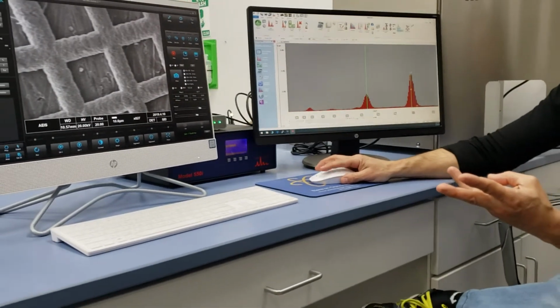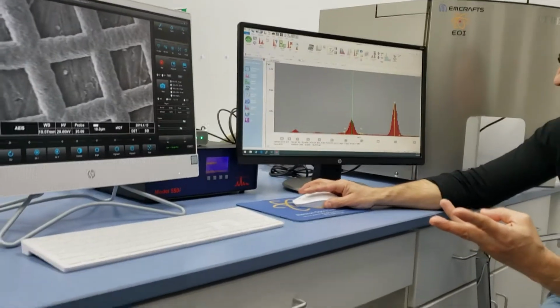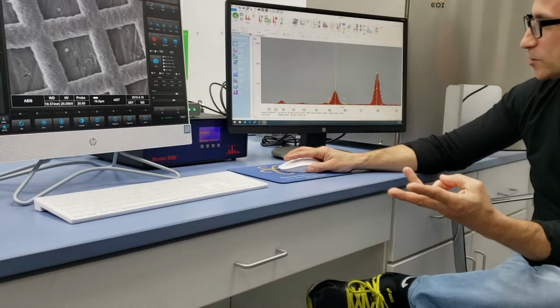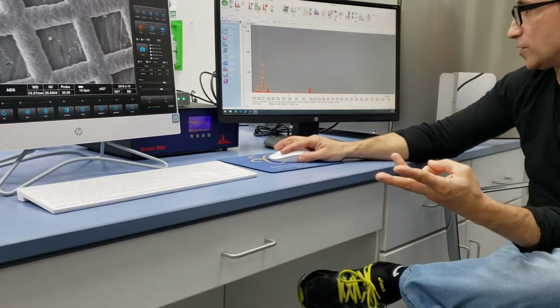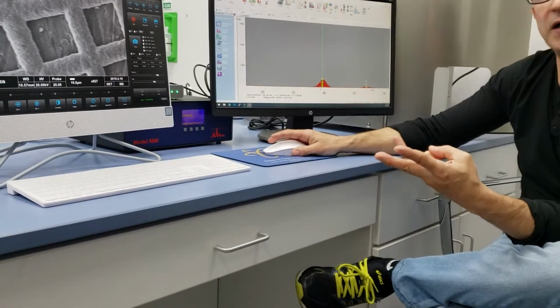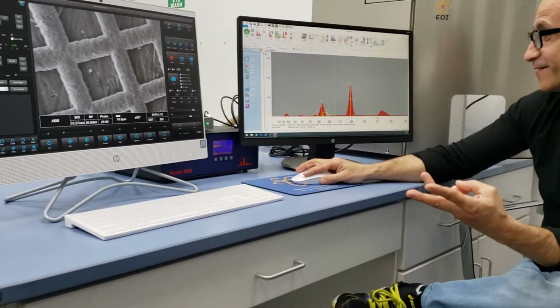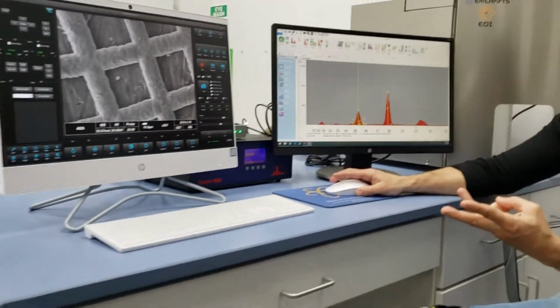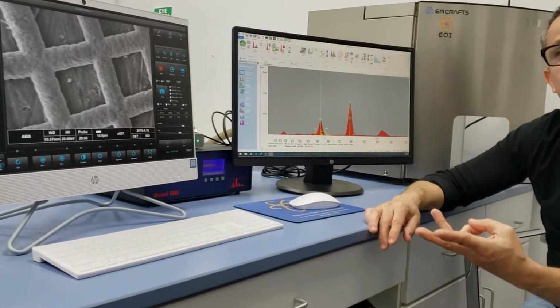Well, if I separate this peak, what the hell? There's no button. It's not neon, and it's not sodium. What the hell is that? Well, it's not a K alpha line. So that's why there's no button for it. But if I come down over here to this peak, and I open that peak and I label that, well, that's a K alpha button for copper. But guess what? Copper has another peak associated with it down here. Copper has an L line as well. So copper has a K line and an L line. I like this. Right? Some elements have multiple lines.